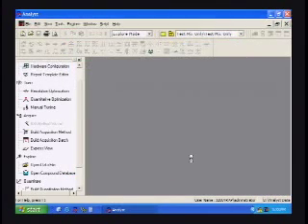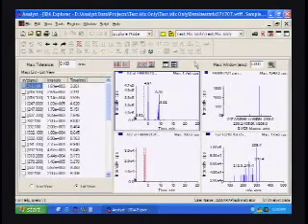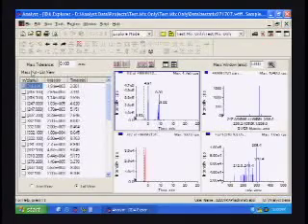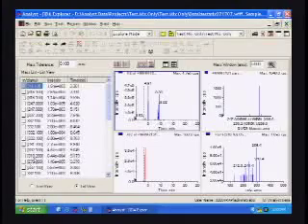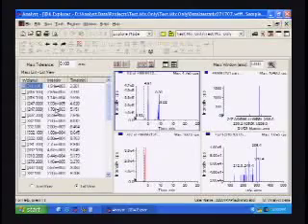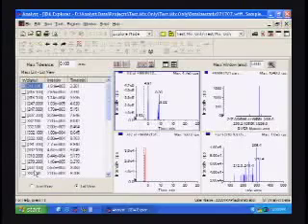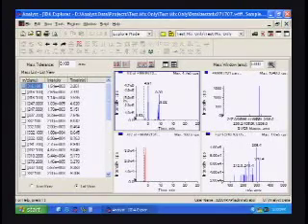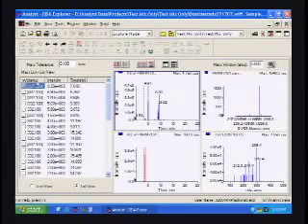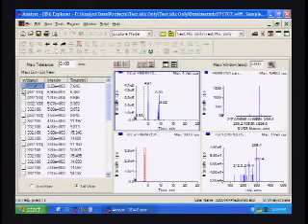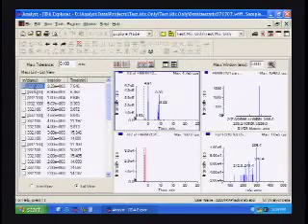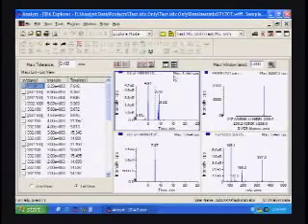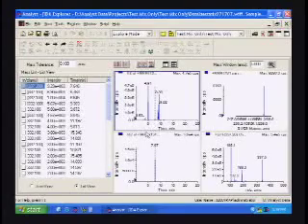What opens up in front of here—I'm going to minimize the navigation bar for clarity—is really a window with four windows inside. The first one on the left side of the screen is a list of masses in brackets. These masses correspond to the masses that were selected for product ion scanning. These columns—mass, intensity, and time—can be sorted by clicking at the top of the column. Here you can see I've sorted them according to descending mass, so 337 is the first mass here. The first of these quadrant windows says at the top TIC.